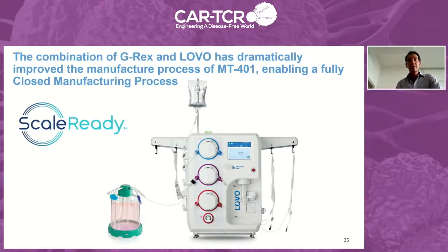So in conclusion, by incorporating the G-Rex and the Lovo, we have been able to dramatically simplify the manufacturing process. Some of these improvements, as shown in the earlier part of the presentation, not only simplified the manufacturing process by reducing the number of interventions and the days of culture, but also resulted in a product that had superior characteristics when looking at the cell phenotype and antigen specificity. And I think that this will create a solid foundation as we now move forward into the phase 2 portion of the clinical study.